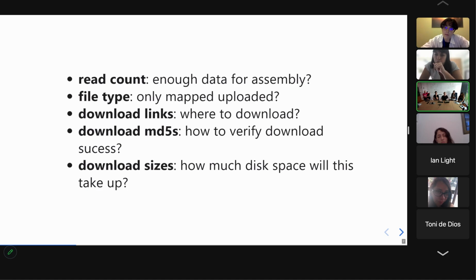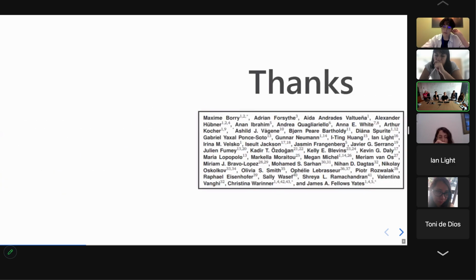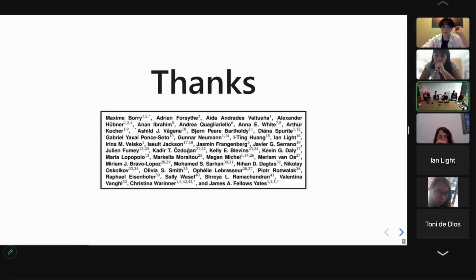And so all of this information is basically in the same schema, the same format that you saw with the sample metadata. So all of that should be pretty familiar to you if you've come across this before. But like I said, it's a community-curated project, and this has been a huge effort of more than 4,000 libraries that we had to scrape through, clean up, put in the right format, and so on. So I want to say thank you very, very much to all the people who contributed to this phase of the project.